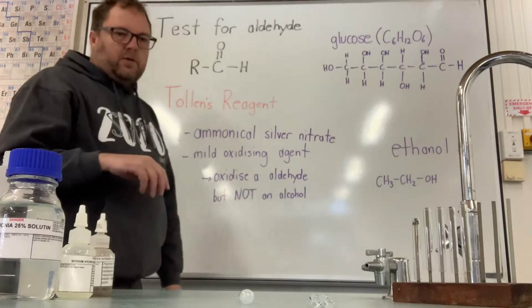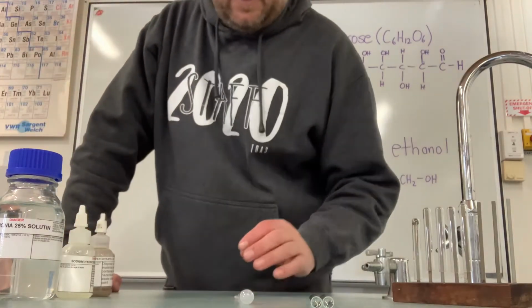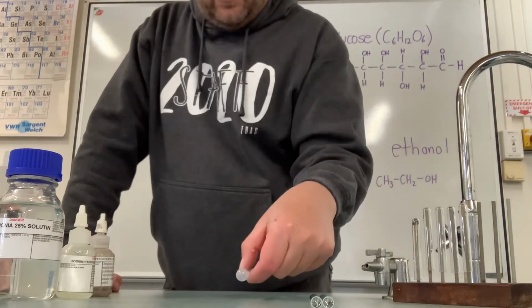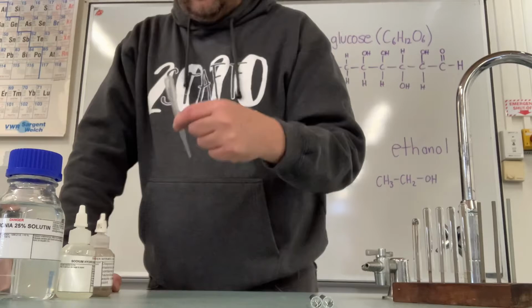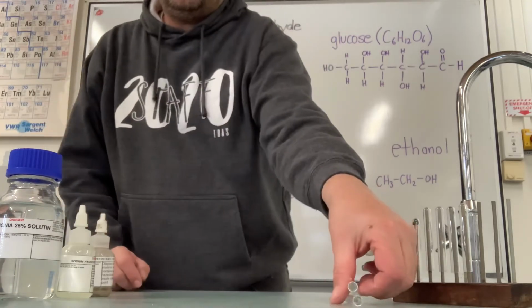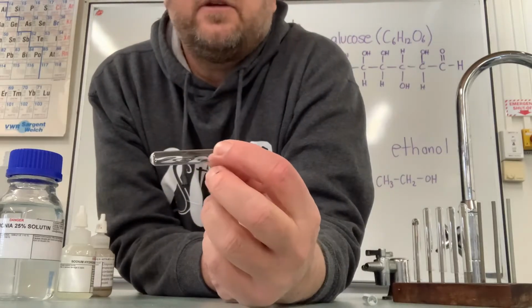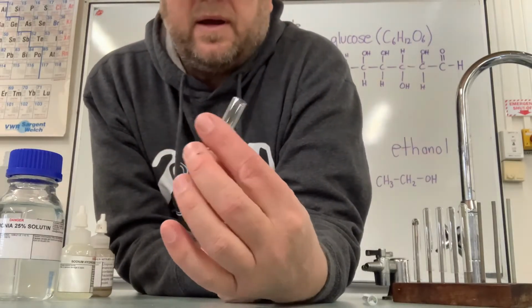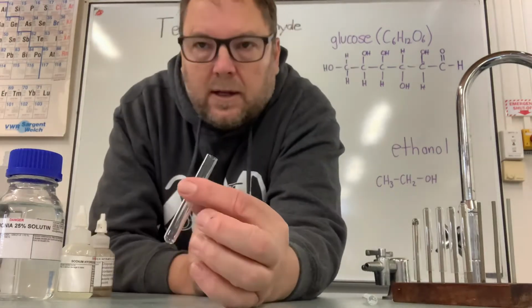So, how do we go about making ammoniacal silver nitrate? Let me just find all my bits here. I think that one goes with that one. Yep. So, we need to start off with a nice, new, clean test tube. And these are not too bad, but I did a test run before. They're not perfect, but let's see how we go.